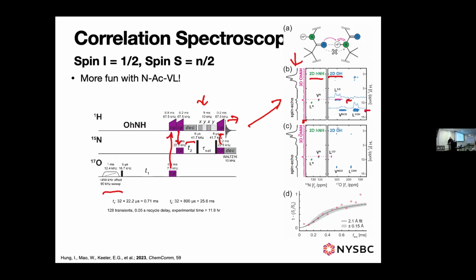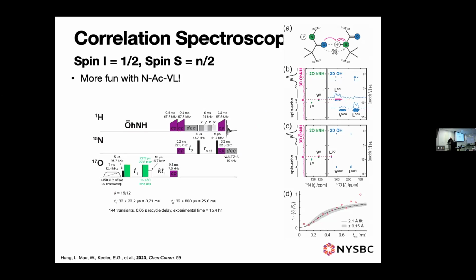Two on the acid and one that's on the amide. Then if we do the same experiment down at the bottom, except we add MQMAS to what we are doing here, we see that we have very narrow peaks now. The blue and pink spectra are now narrow peaks that line up exactly where we would expect.